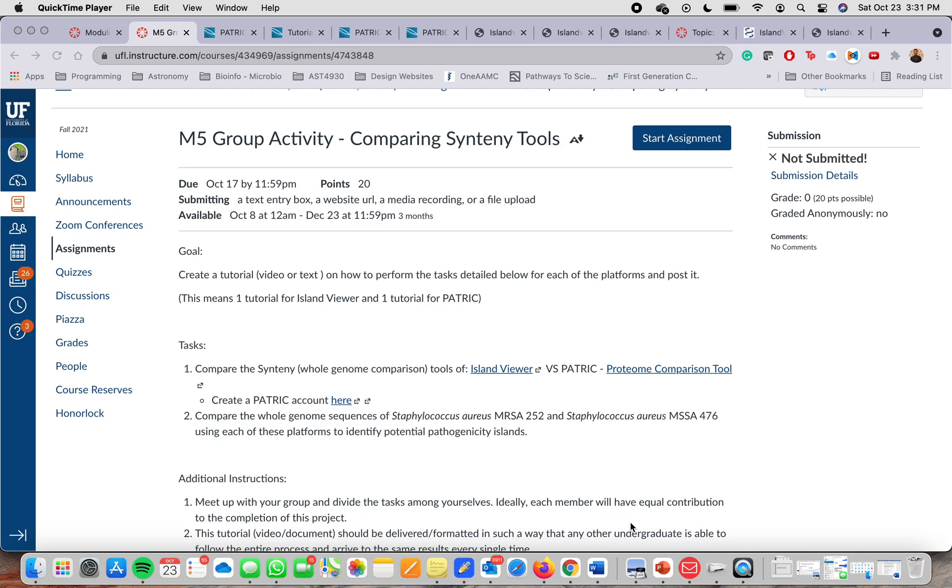My name is Julman Bottino and today I will be explaining how to use two different genome comparison tools to compare genome sequences between two organisms.